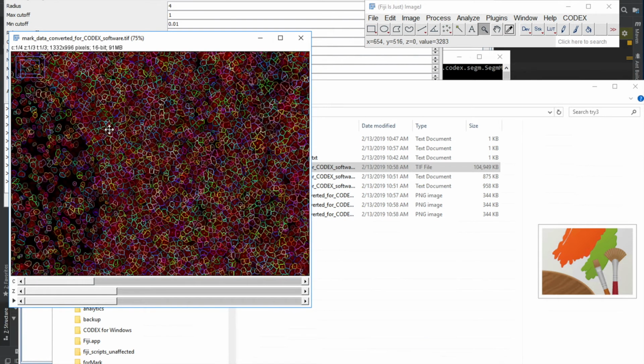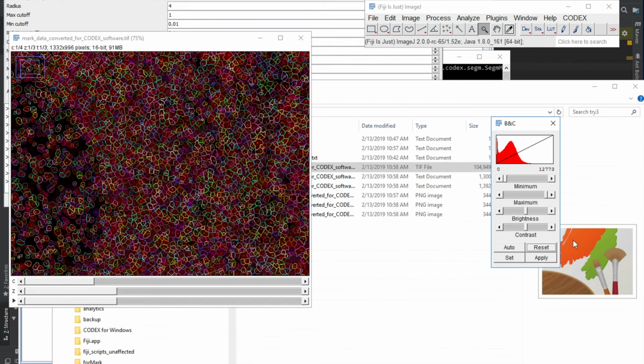Your segmentation will never be 99 or 100% ideal. Usually 80 or 90%, 85% of your cells segmented is a very good achievement, which, if you have enough planes, will produce good quantitative data. And well, that is pretty much all I wanted to show you.